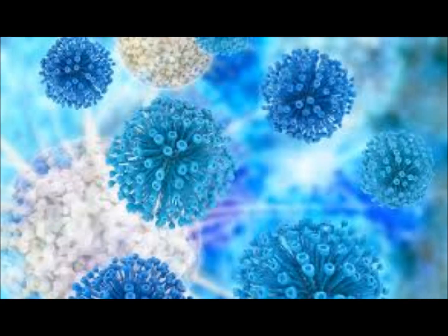But if you're doing anything else, sputum, genital, wounds, fluids, you always have to tell them how many squamous epithelials, how many white cells, and how many bacteria types, and enumerate them. So when you look at that gram stain sheet I gave you, it tells you how many go with occasional, how many go with few. So this is a big deal.